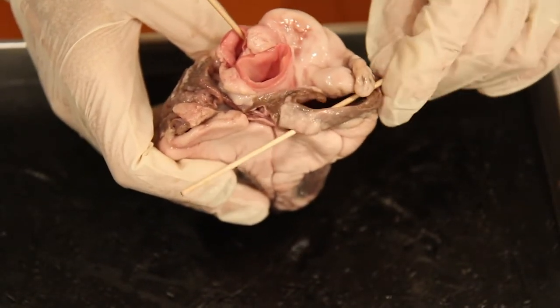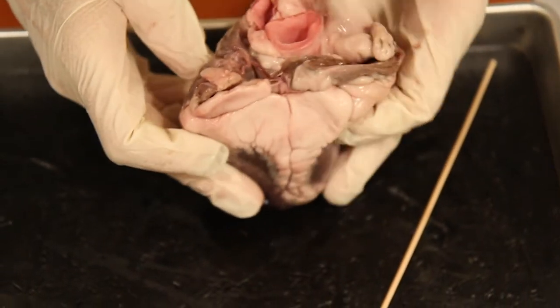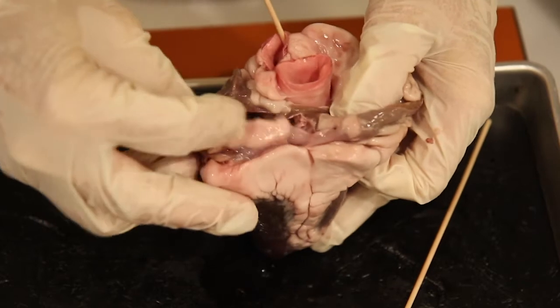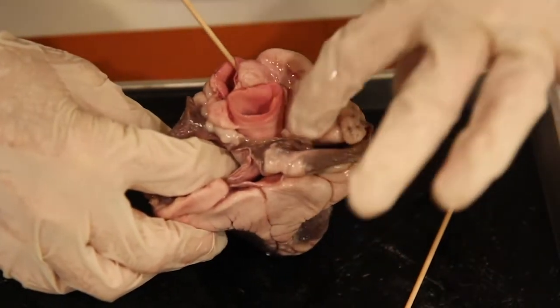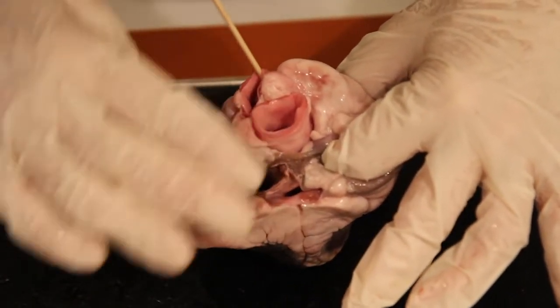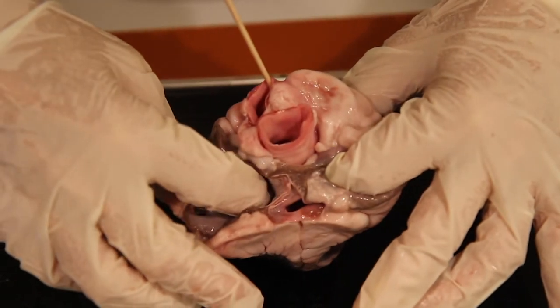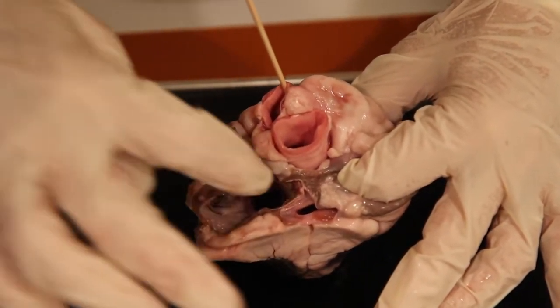The pulmonary veins are also visible in that posterior view — it is a large opening here. If this were cut higher, we would see at least two entryways of blood coming from the lungs. So that would be the region of the pulmonary veins.